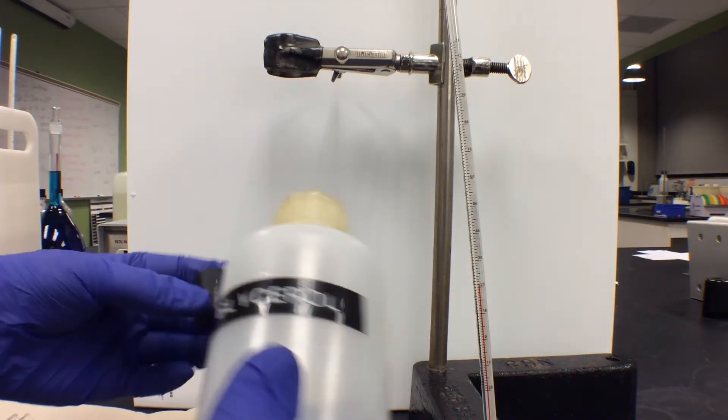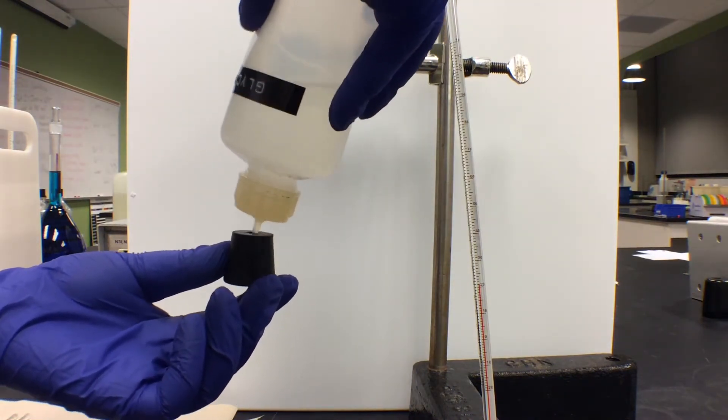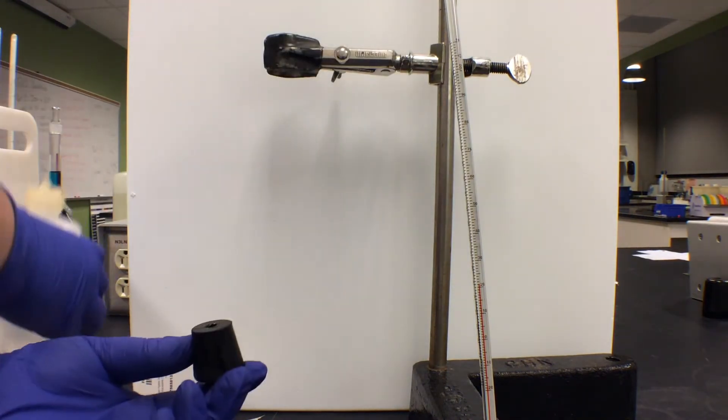To safely slide the thermometer through the stopper, use a little bit of glycerol. Glycerol is a little messy, so be careful.